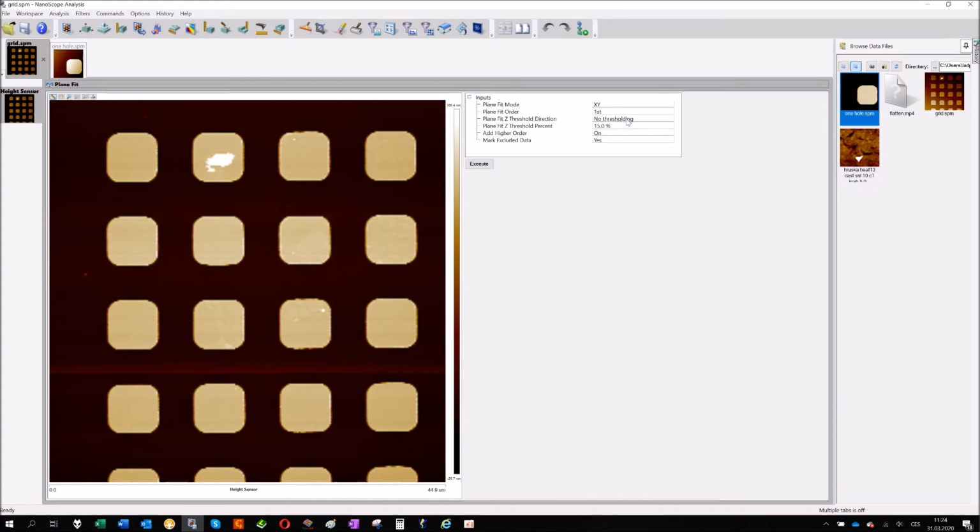Generally, you have the thresholding, which you can use to mark the data which are below or above some limit, and you define it with a percentage, and of course you can mark the data and use it for calculation. So again, the blue curve.